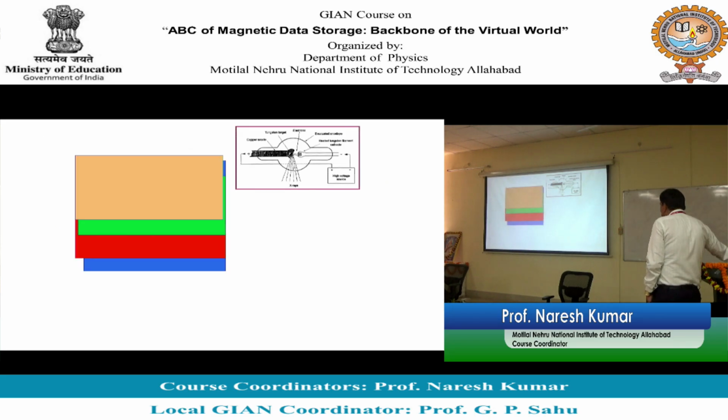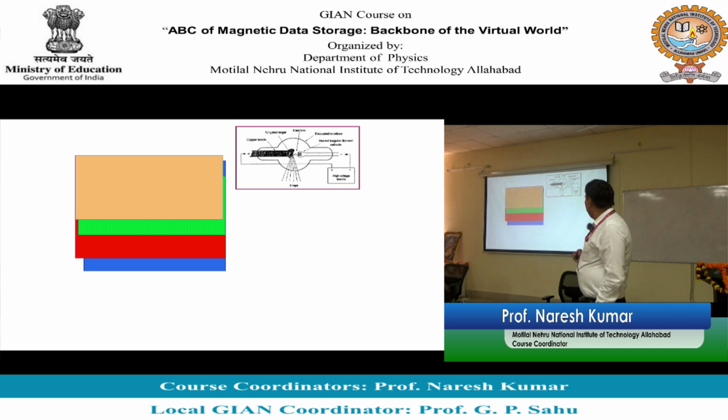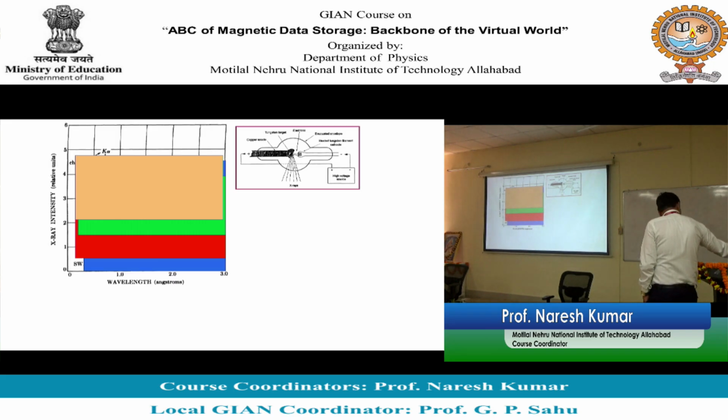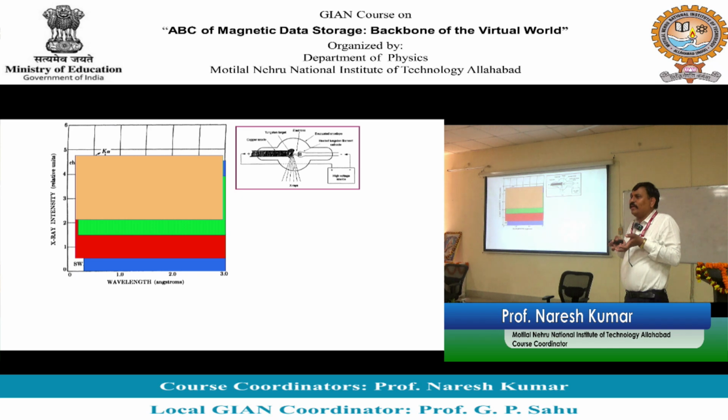Yes, let's now do a virtual experiment. This is my tube, X-ray tube. Here we have a copper target, and we are applying positive potential to this copper and negative here. There are electrons in between. If you apply voltage, what will happen? Electrons will move from here to what? Target, and accordingly what will happen? X-rays will emit. So let us apply some voltage and try to study. The X-rays coming out here, catch them in a detector. Store it in the detector and try to see how wavelength and intensity follow.